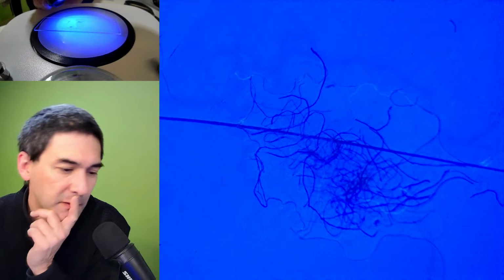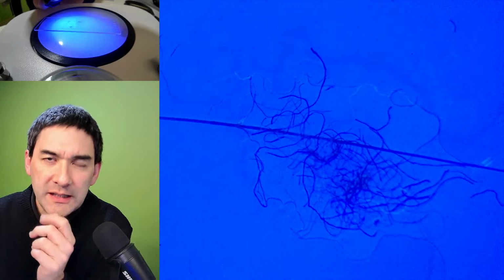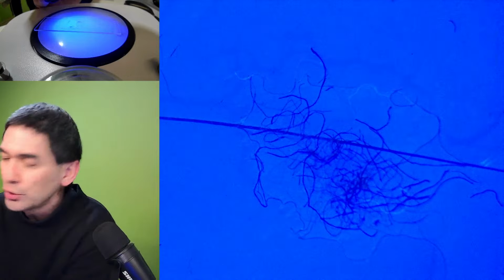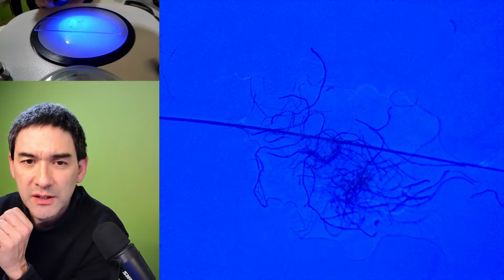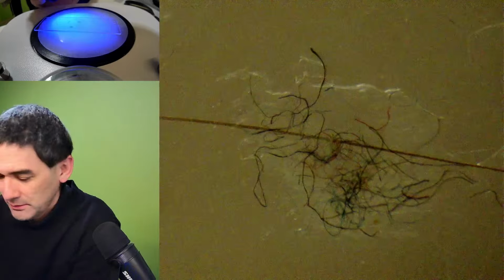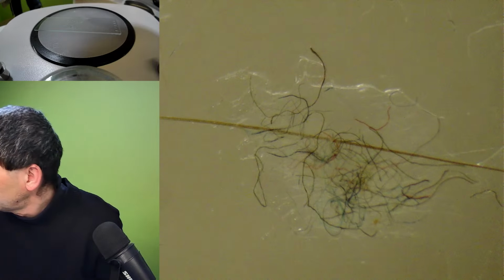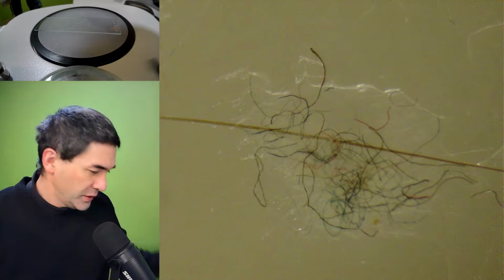There's something that I might try out. Do you know those yellow highlighters? Yeah, they do shine, and sometimes it is possible to stain specimens with those. But you see those here, they don't seem to be very interesting. What about this here? I don't know. Let me try those here.